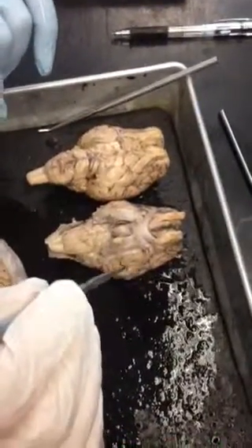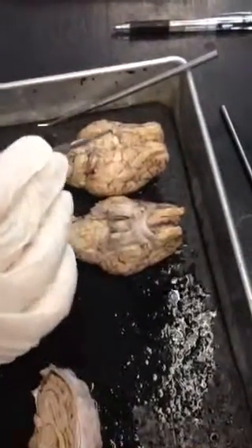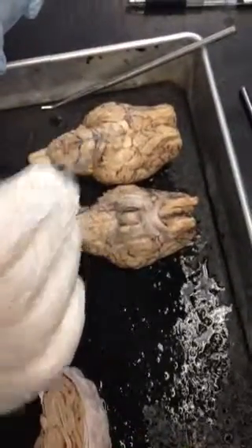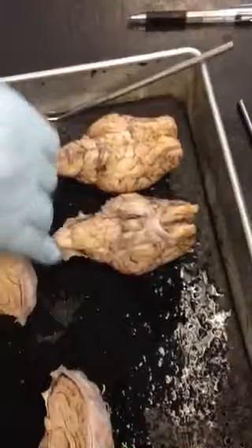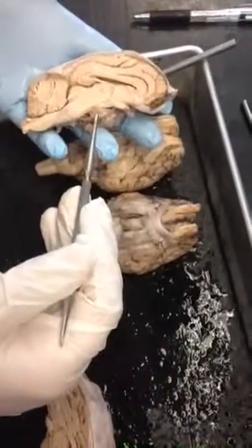So the pituitary gland, this is it right here. If you can find this hole right here, this is where the infundibulum would go, which is what connects the pituitary gland to the hypothalamus. So the pituitary would be right here, if this one had it. And then you can also see it on a section brain. That's the pituitary right there.